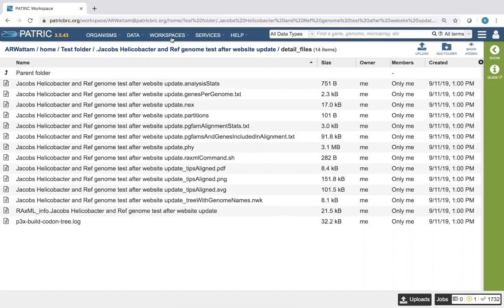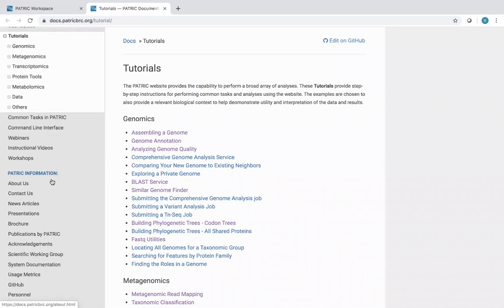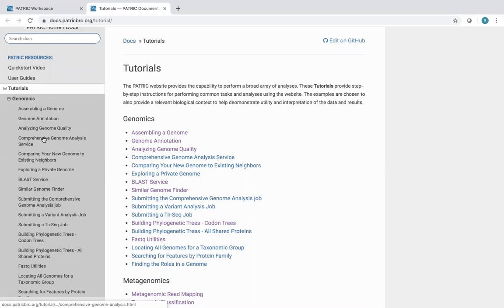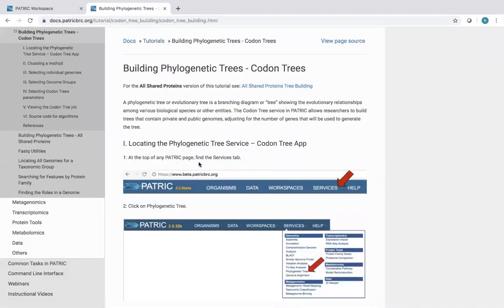Now, before we leave this webinar, I want to show you, let's go into Help and go to the tutorials. And we need to click on Genomics. And then we need to find Building Phylogenetic Trees, codon trees. So let's click on that.